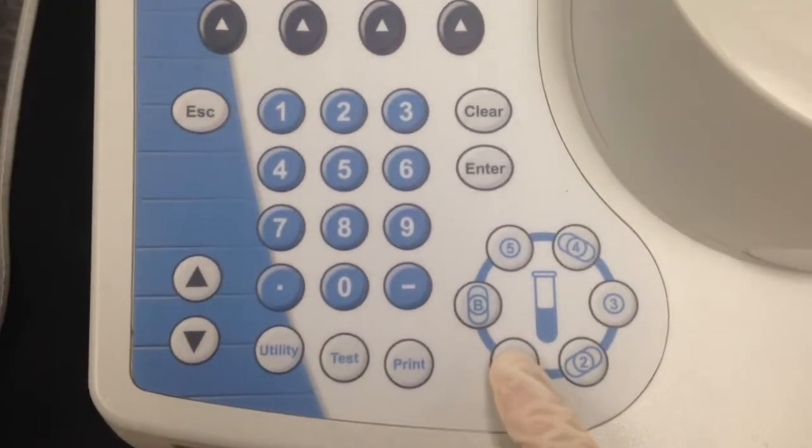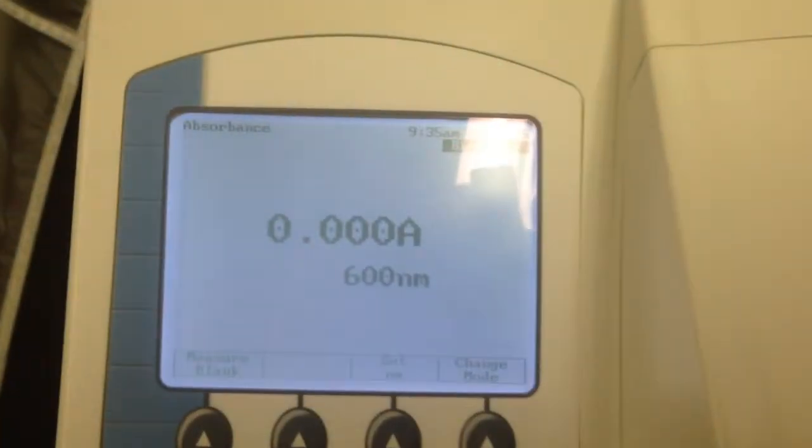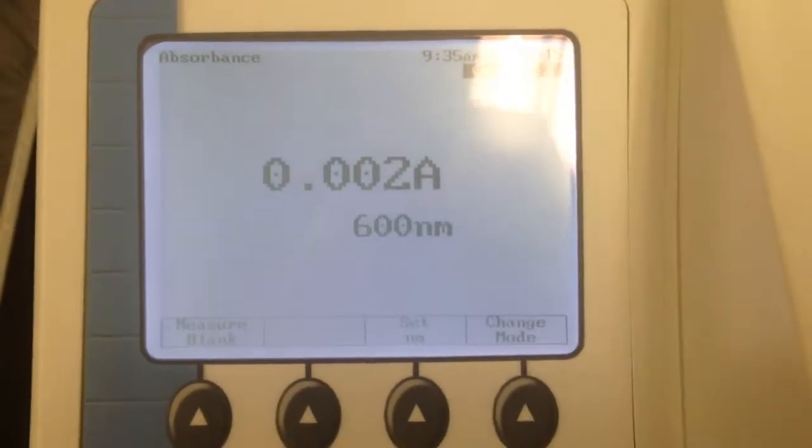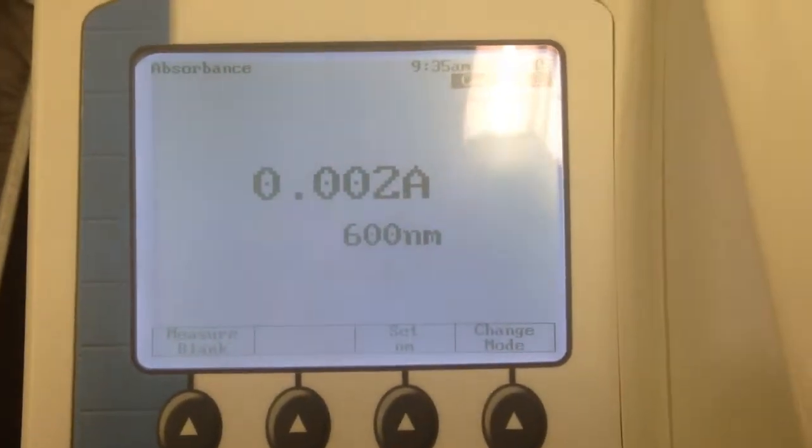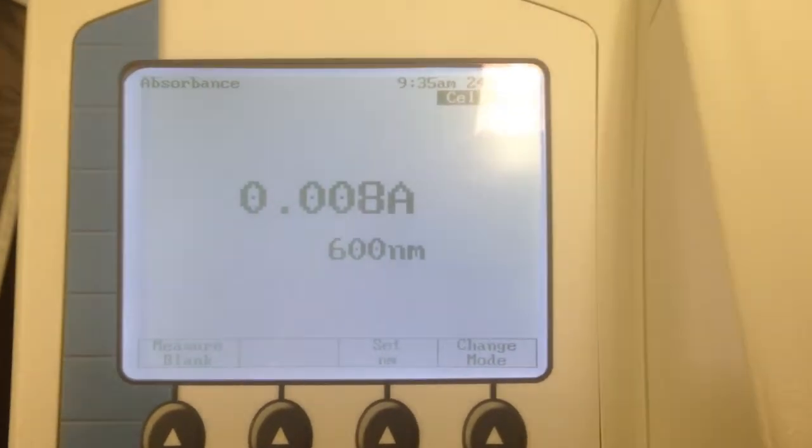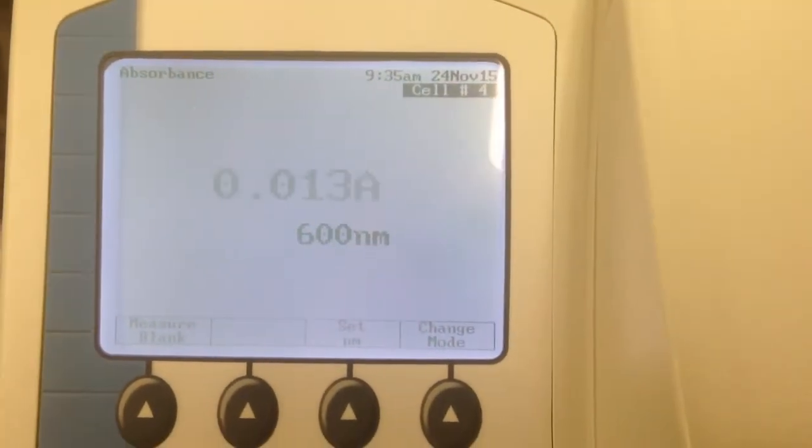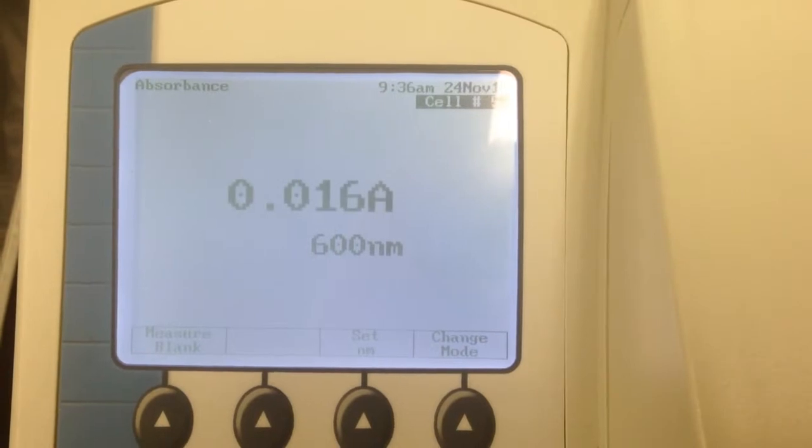After measuring your blank, go ahead and measure all of your samples. You will notice that as the concentration gradient of my samples increases, meaning that the more food coloring is in my samples, the greater the absorbance value.